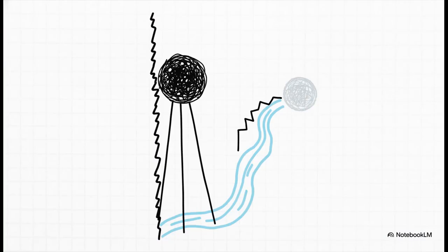Now, this right here is the core mechanism of retention. It is the absolute heart of ion chromatography. The separation of ions, or polar compounds, happens because they interact with ionic sites on the solid stationary phase as they are transported by the mobile phase. Our source material notes that this process is actually much slower than what you'd find in other forms of chromatography. But the absolute key takeaway here is that retention depends entirely on charge density. If an ion has a higher charge density, it's going to hold on tighter and be retained much longer on the stationary phase. It is fundamentally a battle of electrical attraction.